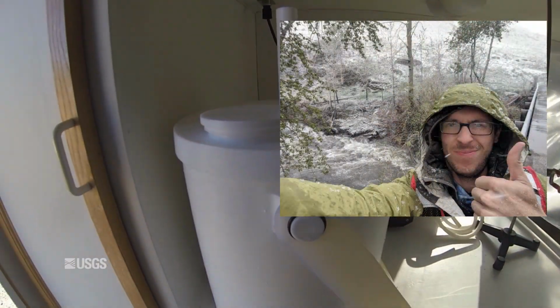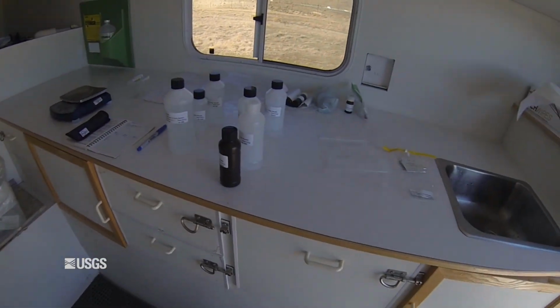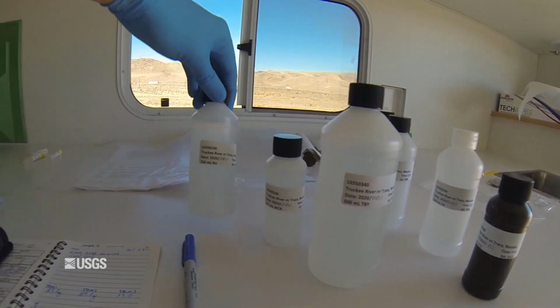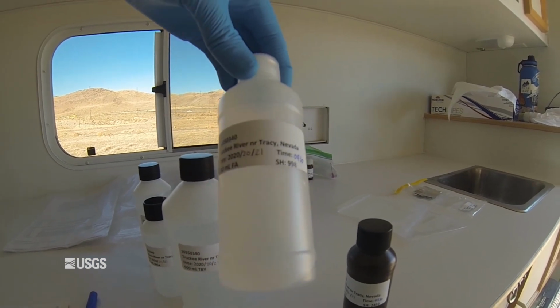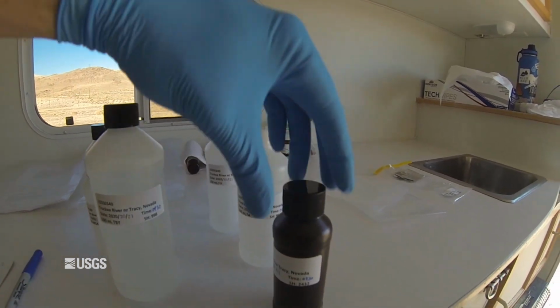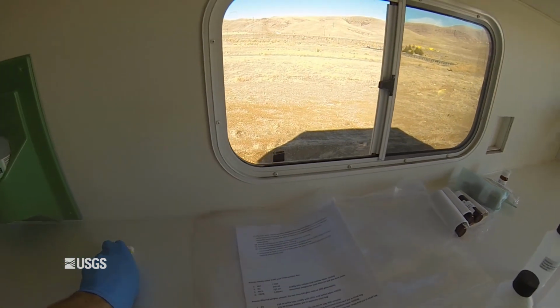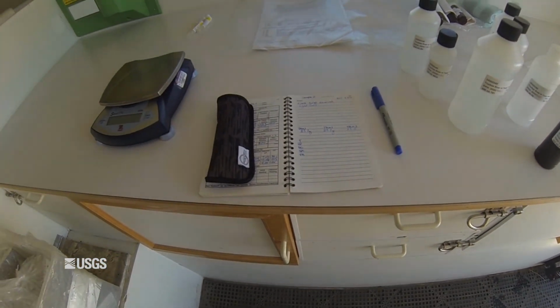My name is Bryce Redinger with the Nevada Water Science Center, and here's the churn that the samples we just collected are going to go into. Here are the bottles that we will split that water into. We have unfiltered here, and then we will filter them into these. These are labeled so the lab knows what kind of processing to do on each of these bottles. Here we've got a pesticide sample. Here are some acids that we add to each of the samples depending on what they are. You just take really good notes.